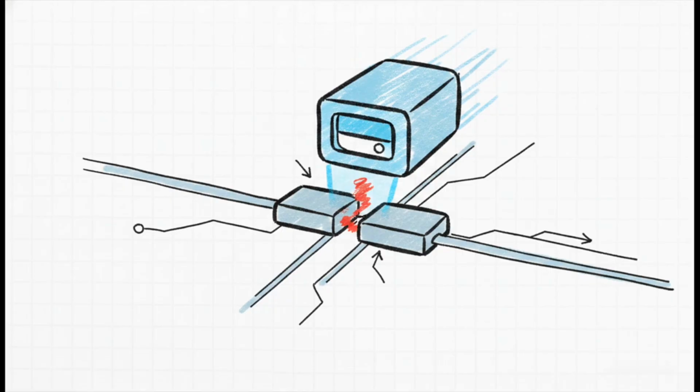When a modern microprocessor has billions of tiny transistors, a microscopic defect on a single 100-nanometer gate can cause a catastrophic failure. The FESEM acts as the ultimate quality assurance inspector, diving deep into the silicon trenches to make sure every single nanoscale component is flawlessly constructed.